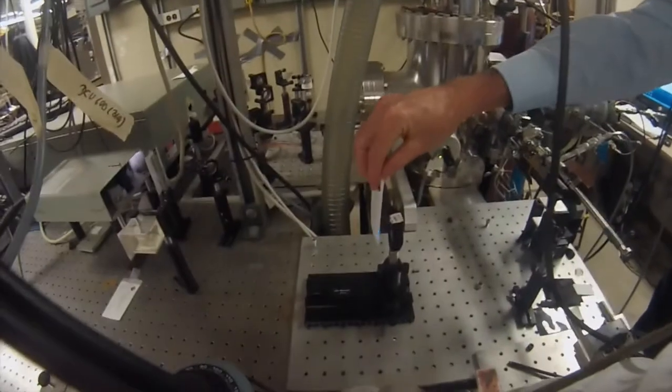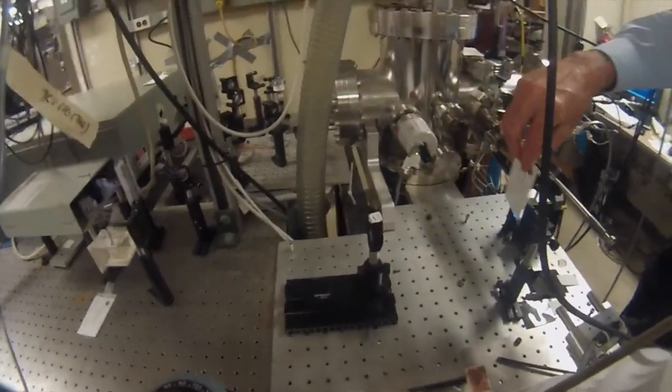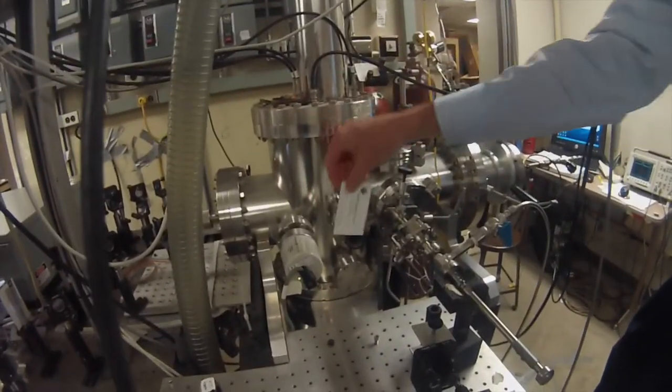And then if we come right over here, you can see it goes through a lens and then into a last turning prism and right here into our vacuum chamber.